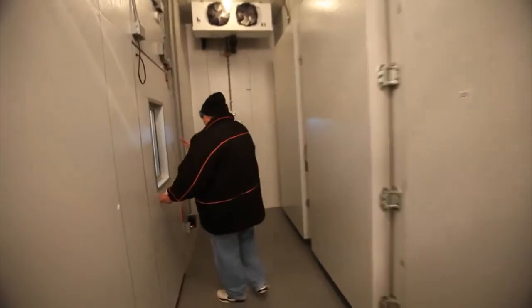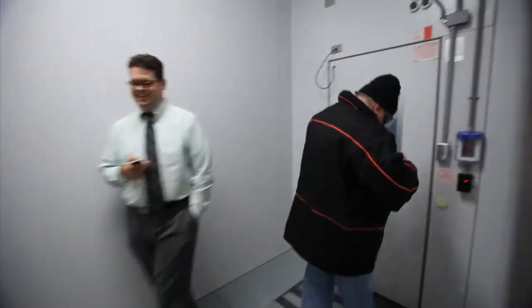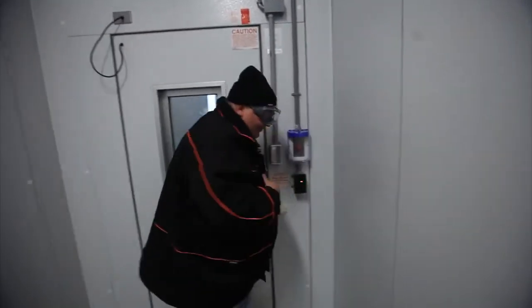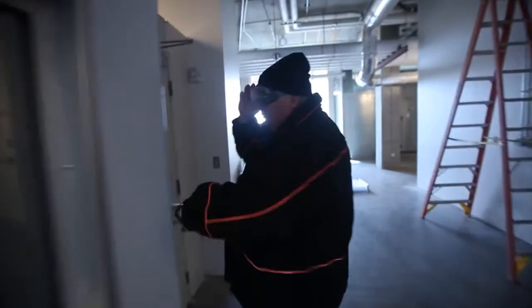And you don't actually walk into that. You wear gloves, you pull samples out of that space. But you still have to protect yourself. You do the full garb, okay, to prevent freezing, frostbite, and so forth. We worry more about the eyes, so wearing goggles is important, as well as protecting your nose so you don't breathe in that extremely cold air.